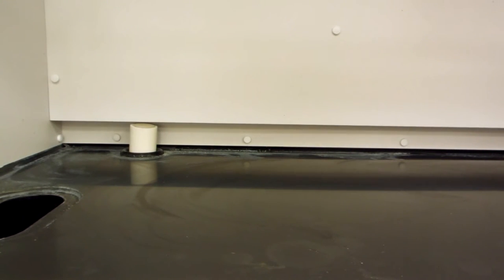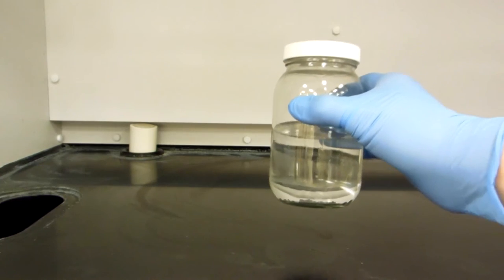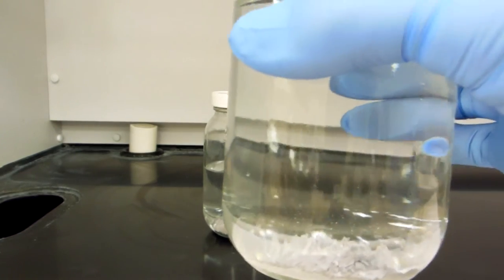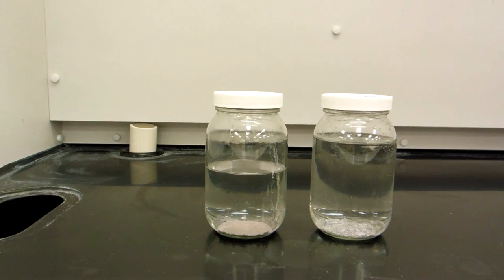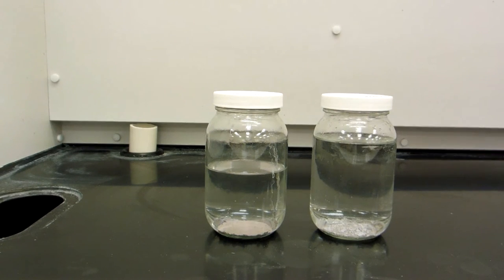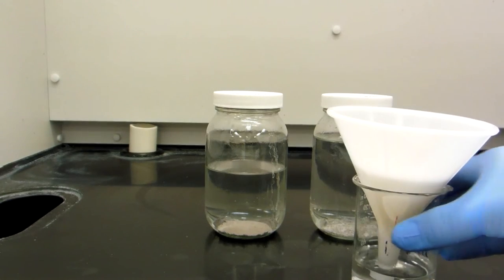So this is how they look now. As you can see, there is a whitish color solid at the bottom of each of the jars. So it has settled. And now I will use an empty beaker as shown. So that's my other bottle. So now I'll pick up the empty beaker. And I have another beaker. This contains the filtered out sodium chloride solution.